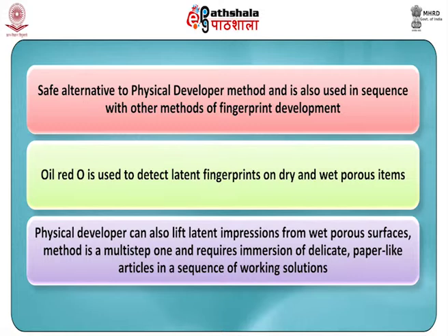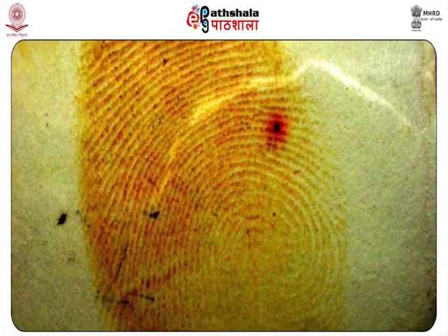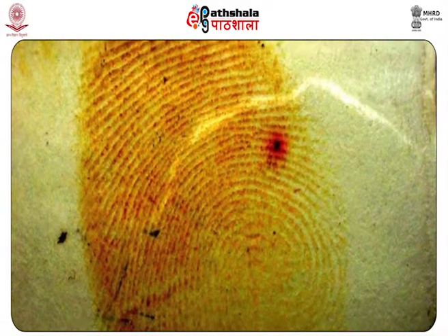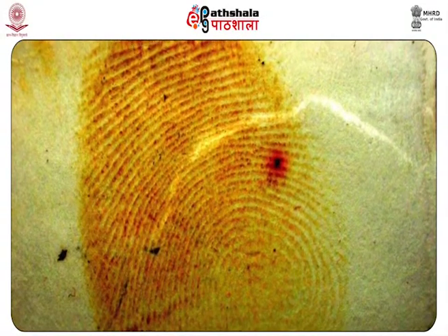Although the physical developer can also lift latent impressions from wet porous surfaces, the method is a multi-step one and requires immersion of delicate paper-like articles in a sequence of working solutions. Compared to that, the operational steps of the oil red O method are simple. The reagent develops clear, stable, red colored fingerprints which may be discerned in natural light.